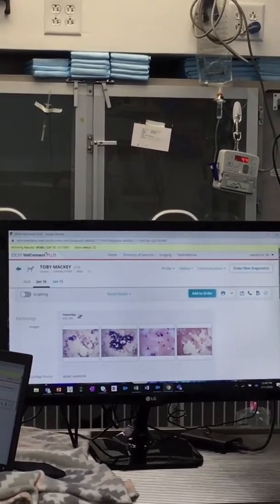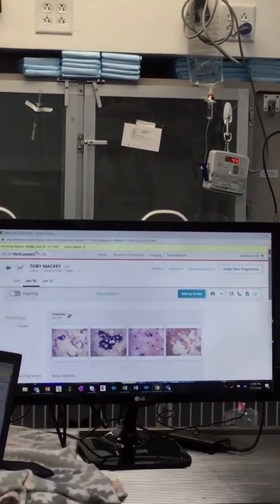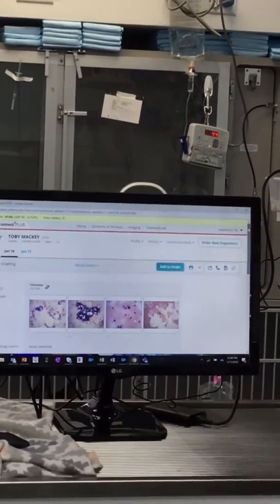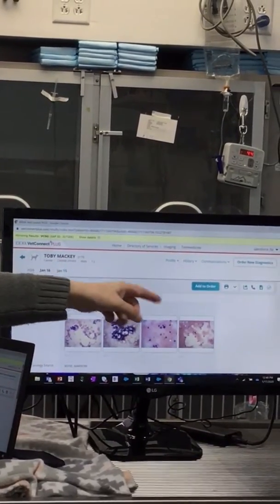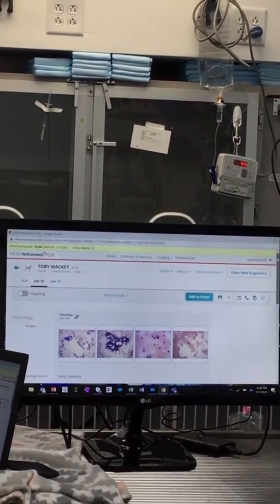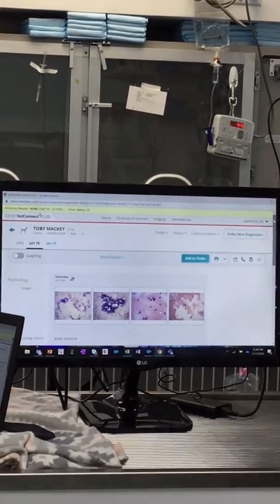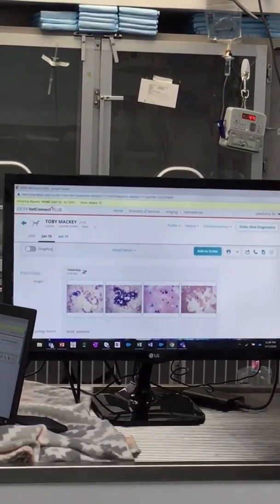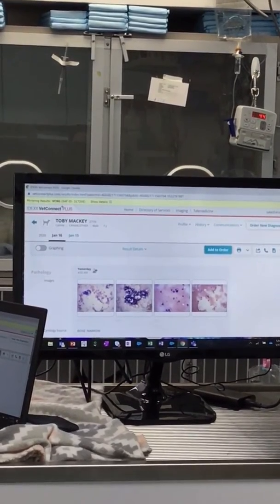Any questions so far? No? Do y'all feel comfortable using it, if you needed to look up tests? Now you still want to start an EVET, that way the results do go into EVET, but adding a test, probably wouldn't on a biopsy, but right there you could just hit add test. That way you don't have to call. Do y'all have to call in a lot to add anything? Okay. And it's nice at 2 o'clock in the morning, you just have to put add test and you're done. So, cool. And everybody's comfortable in EVET with how to do a request for in-house and also sending it out? Is everybody comfortable with that? Okay, most people know.